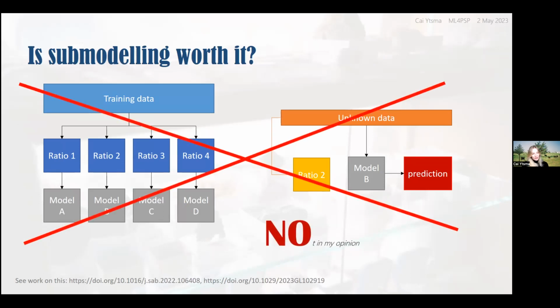In my opinion, no. Not only is making, deciding, and formatting submodels a lot more work than making one model, while individual submodel results may seem way better, they often vary widely and are just as bad in the other direction. So they end up having a comparable average performance to a single generalized model. And larger models are also more robust. So splitting the data into smaller pieces and smaller models opens them up to overfitting or misclassifying an unknown and ends up being counterintuitive.